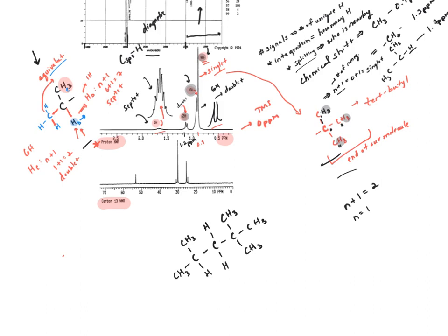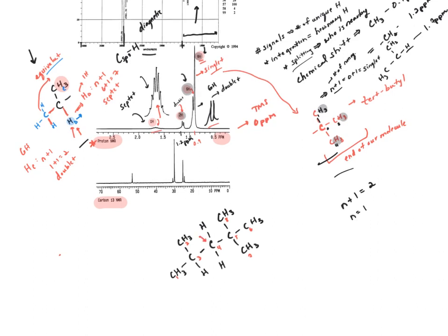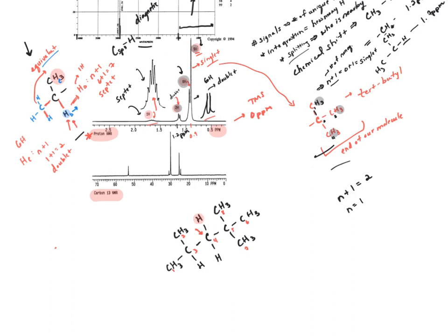Okay, so again, let's make sure everything fits the overall spectrum. This is it. We have how many carbons? 1, 2, 3, 4, 5, 6, 7, 8. For hydrogens, we've got 18, so we're good there. Now, for this last little bit, does it fit? We need 2 equivalent protons, because it integrates to 2. These are equivalent, and they're only near 1 non-equivalent proton that can split their signal.